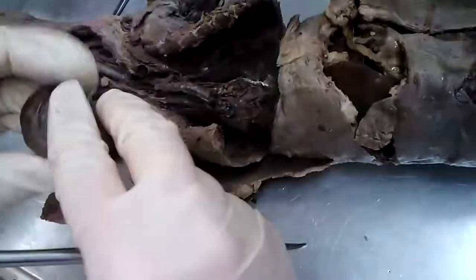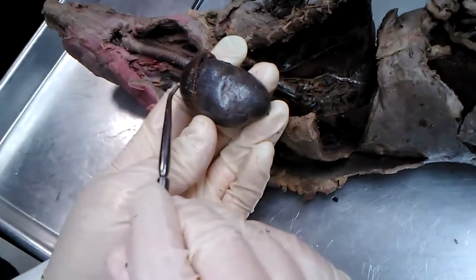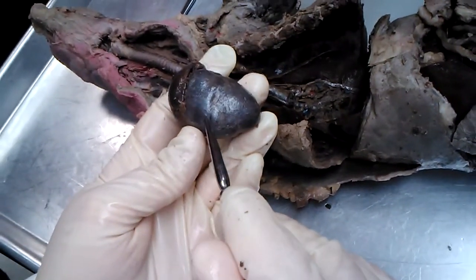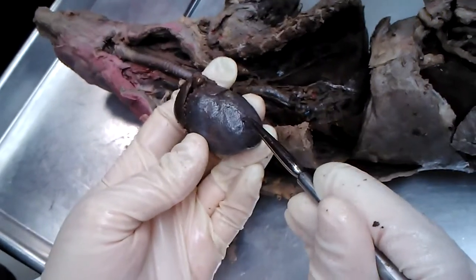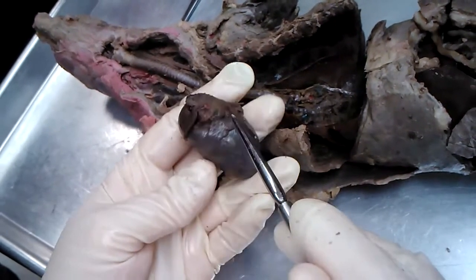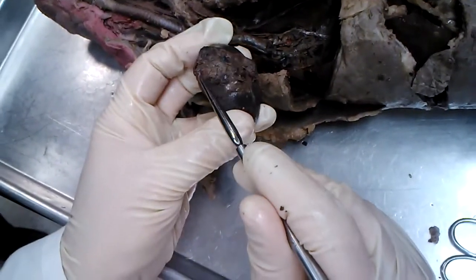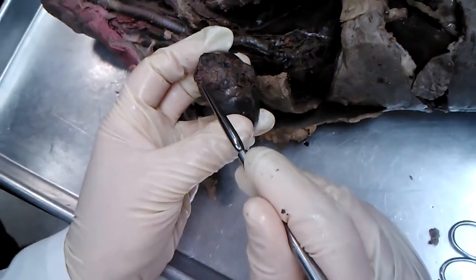So holding up the heart, how it would appear inside the mink. What are the different parts of the heart? We have the right atrium, right ventricle, left ventricle, and on the back side in here was the left atrium. Then up on top here we have the stoplight. See, like 1, 2, 3 structures, blue, red, blue.